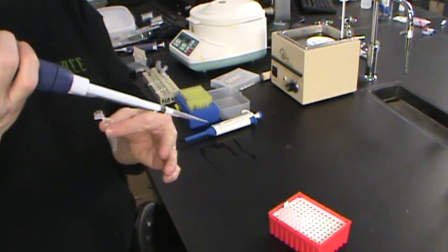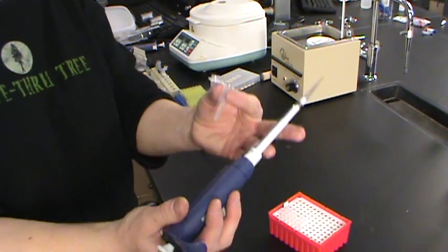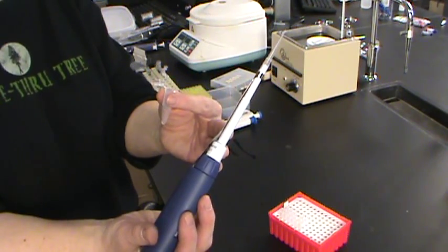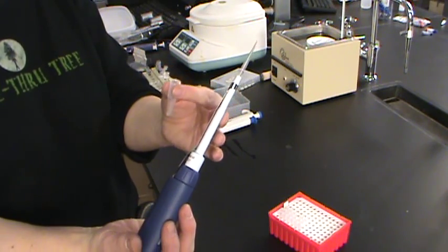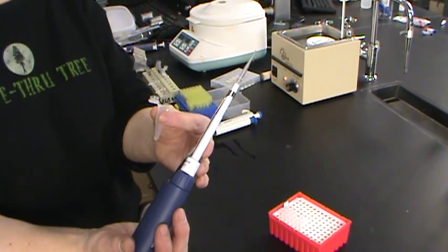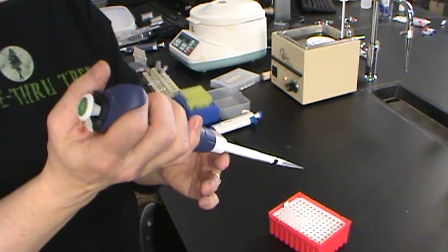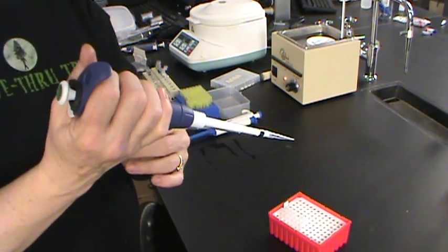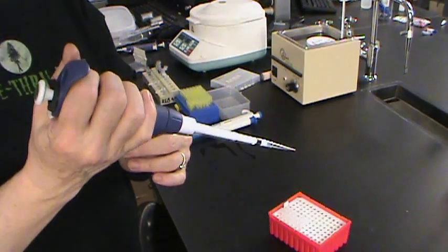Do be careful with the pipetters that you don't lay them down with liquid in them. We never turn them upside down with liquid in them, because if we get liquid in the barrel of the pipette, that has to be fully cleaned. If it has to be sent back to the company to be done, that can be a $100 job. Now, these pipetters are well over $300 a piece, and so we're trusting that you're going to handle them carefully and use them responsibly in lab this week.